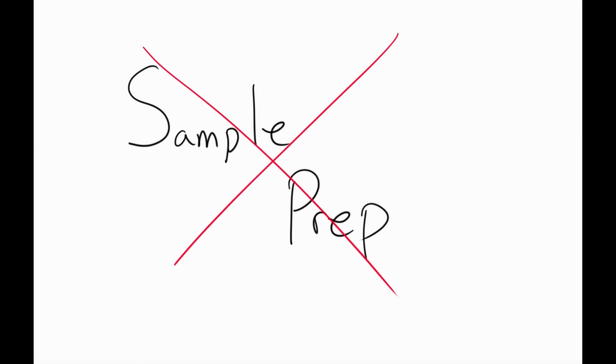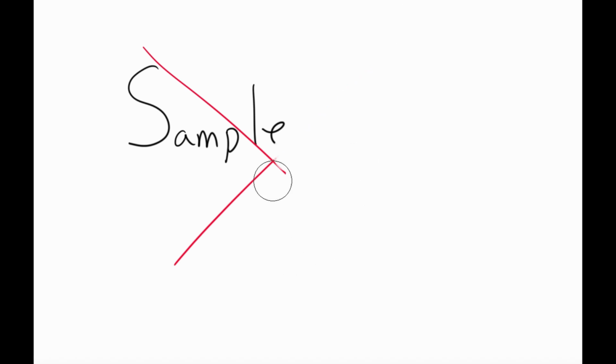Sample preparation for LIBS requires nothing. Little or no sample prep is needed to perform LIBS, and portable versions of this characterization technique can even be performed on-site. However, sample size is important because LIBS requires a minimum amount of mass in order to analyze a sample. The amount of mass required can vary element to element, but on average, the interaction volume, or the size of the excited sample for LIBS, is about 0.1 millimeters cubed.